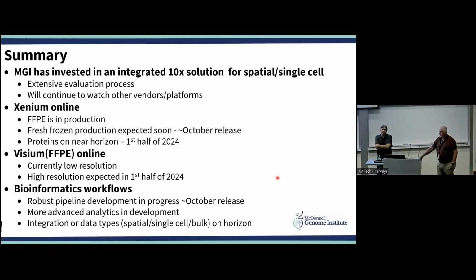They have mentioned tissue types that can be difficult to work with. I don't know if they have a published list or not, but they have mentioned to us in some of our discussions that there are some tissues that are a little bit harder to work with. If you've got a question, we would directly send that question to 10X to say, here are the tissues we've got investigators thinking about. Are there any in here that you know are particularly difficult to work with? And 10X's website, in my opinion, is second to none in terms of help for that sort of thing. The technical support is great.